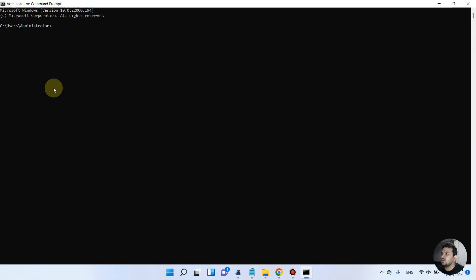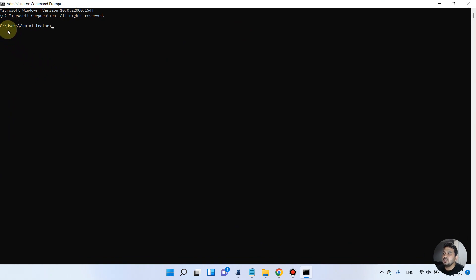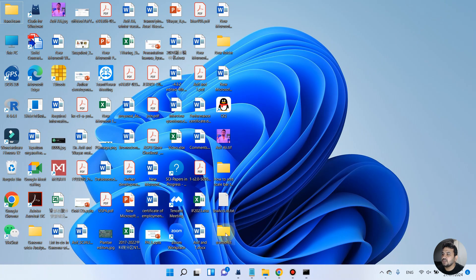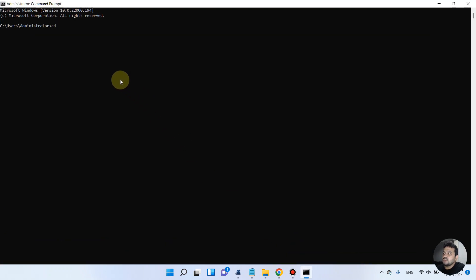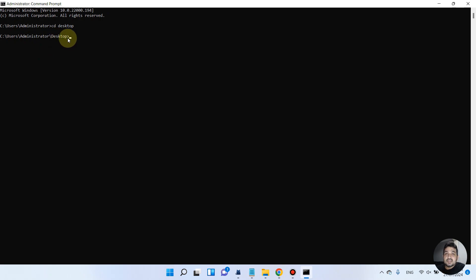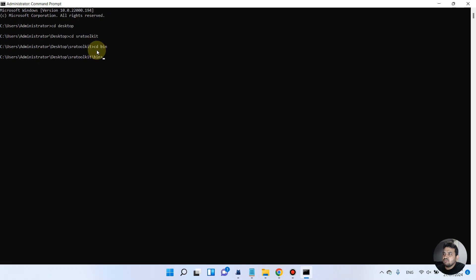On the command prompt we are currently at local disk C. We want to navigate to the desktop and then into the SRA Toolkit folder, then into bin. We will write 'cd' (change directory) to desktop and press enter — no error, so we are now at desktop. Then we change directory to the sra_toolkit folder, and then into the bin folder.